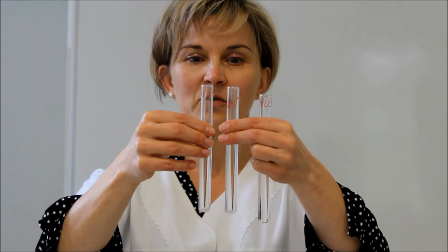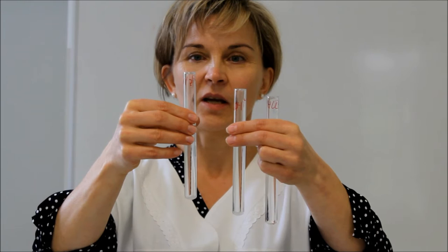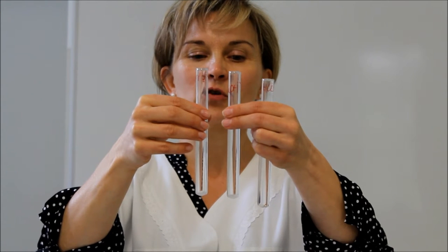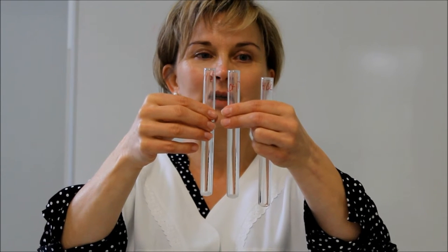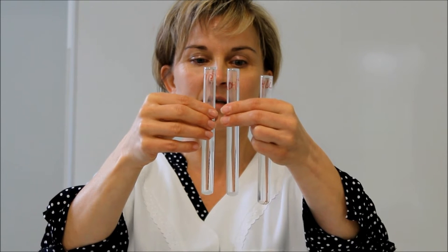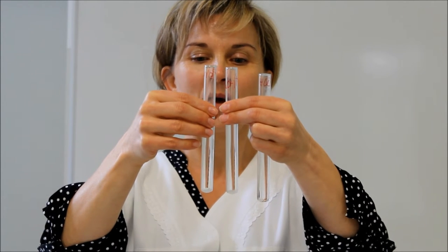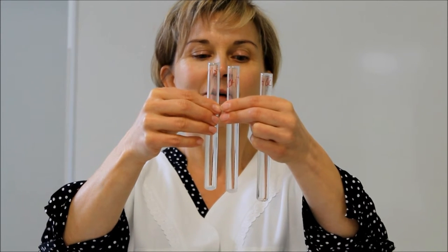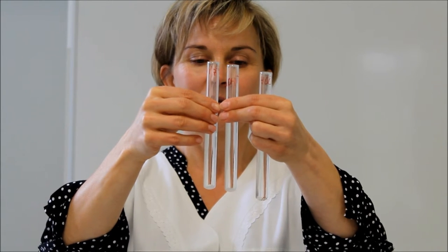A kísérletünk eredménye a három kémcsőben látható. A jobb kezemben lévő kémcsőben víz és pepszin oldat volt tojásfehérjével. A középső tartalmazta a nátrium-hidroxid oldatot, a pepszint és a fehérjét. A bal oldalon pedig a sósavat, a pepszin oldatot és a fehérjénket. A kémcső alján látható, hogy a három egyenlő mennyiségű fehérjéből a sósavas és pepszines közegben a fehérje mennyisége csökkent a másik kémcsőhöz viszonyítva.